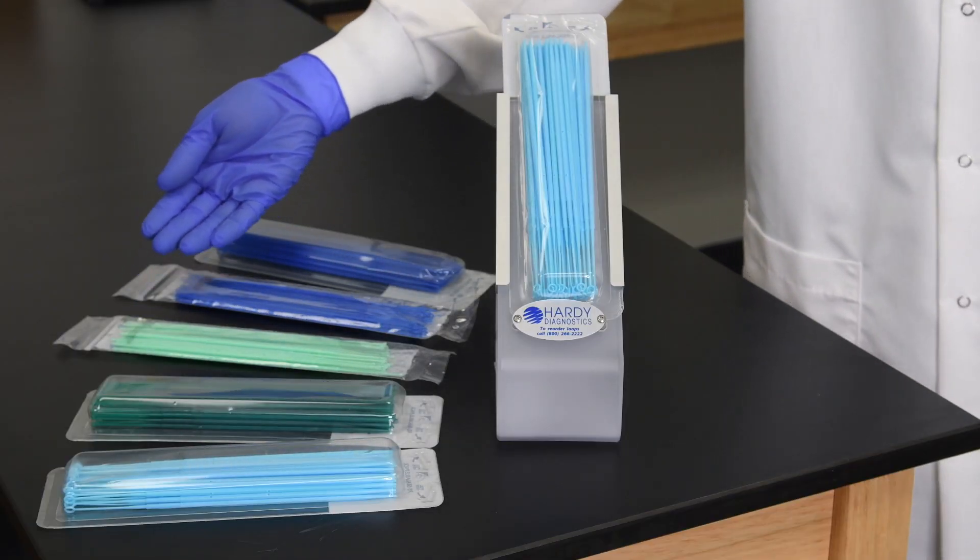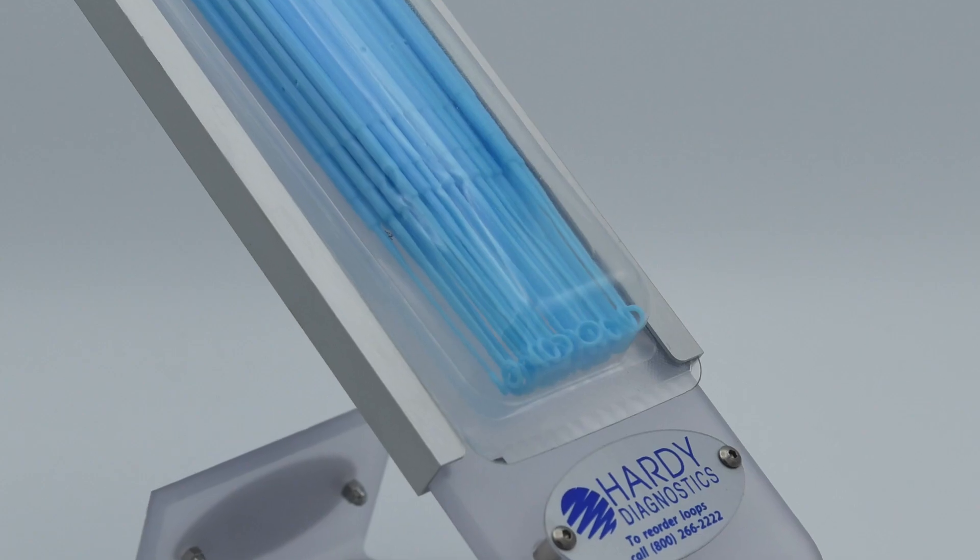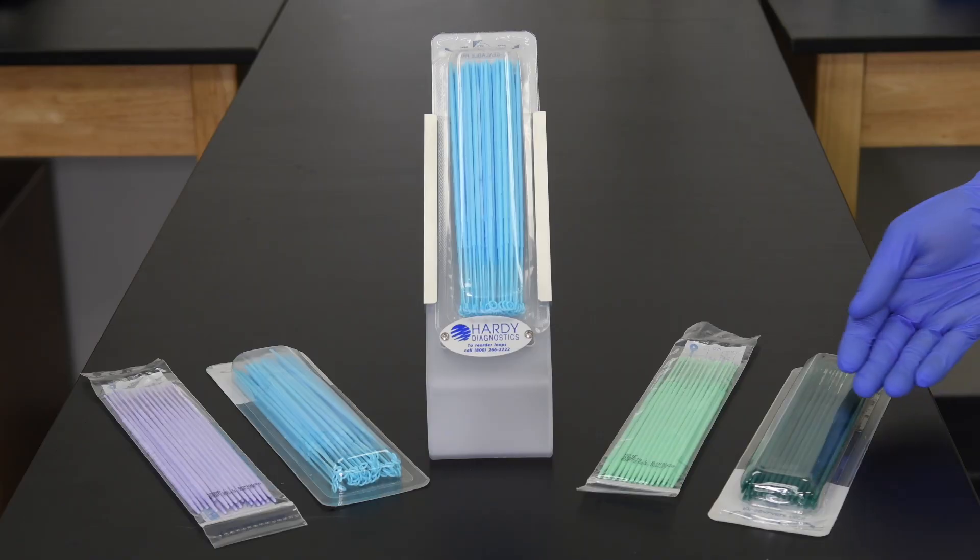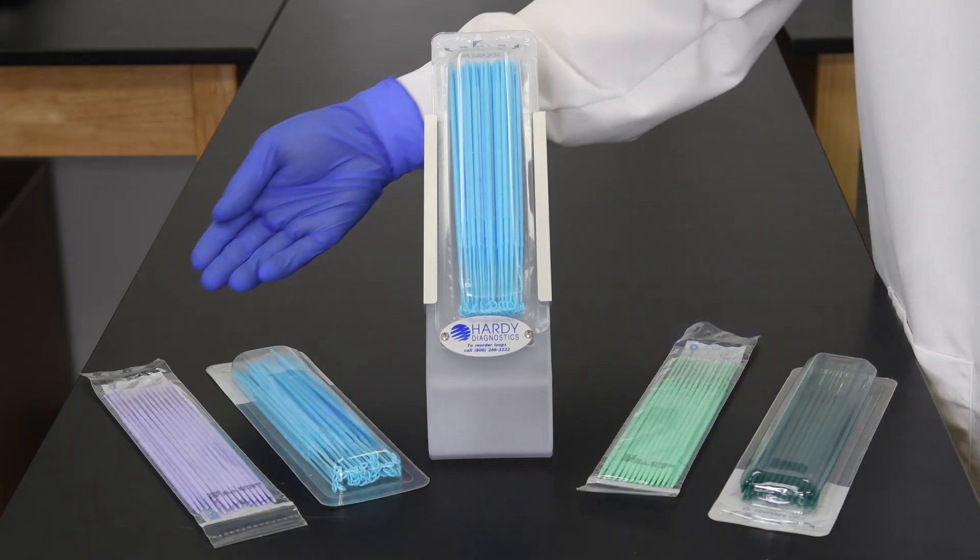The loops come in two sizes of calibration, 1 µL and 10 µL. Loops are available as rigid or flexible, as are inoculating needles.